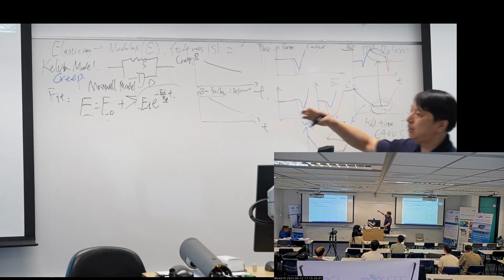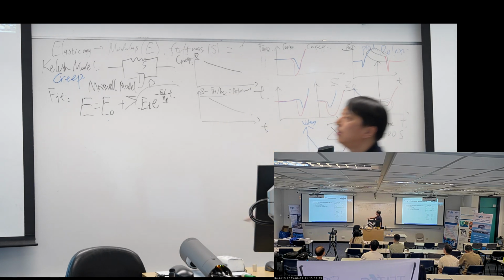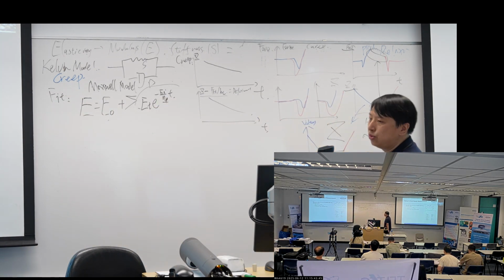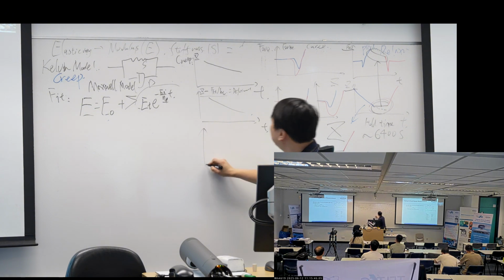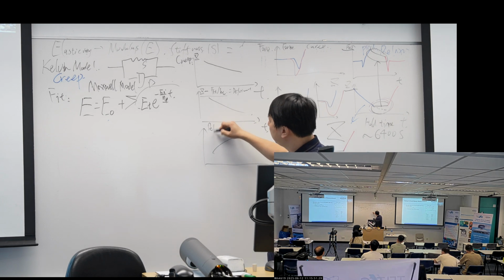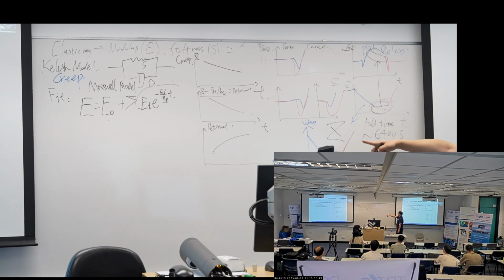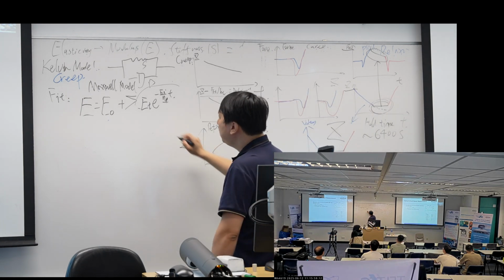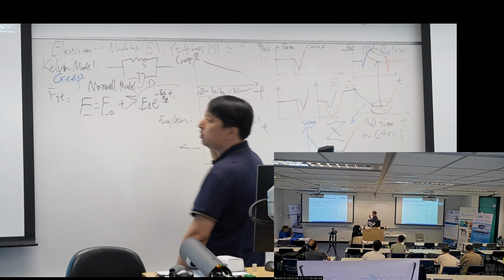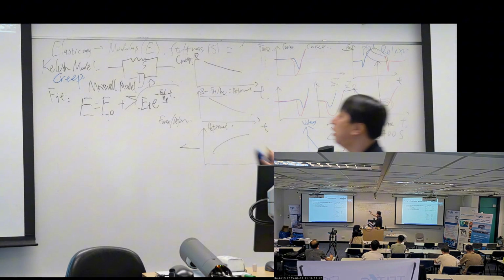And Bruker defines moving down as the positive value. So it's something like this. So we need to apply a inversion to be something like this. That's our final deformation against the time. And then we need to use our force to divide by this deformation. The force is a constant value.